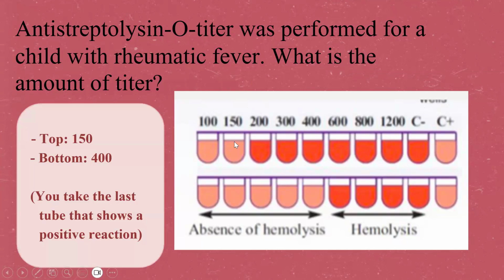Okay. I should change that, excuse me. I just took it from the 14th batch. Okay. No, I'm very sorry, excuse me. This is the first thing. Okay, you take the last tube that shows a positive reaction.